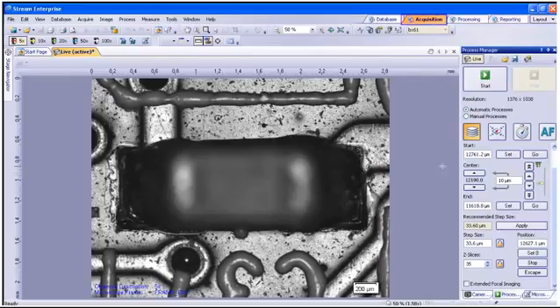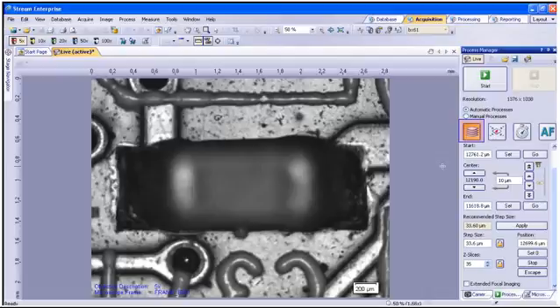Within the Acquisition tab, start by adjusting the sample to the bottom level of focus as shown. You will need to interface with the Process Manager tool window and be within the Automatic Processes. Automatic processes are available within Stream Motion or Enterprise. Make sure Instant EFI Extended Focal Imaging is selected, and for this demonstration only this one process is selected.